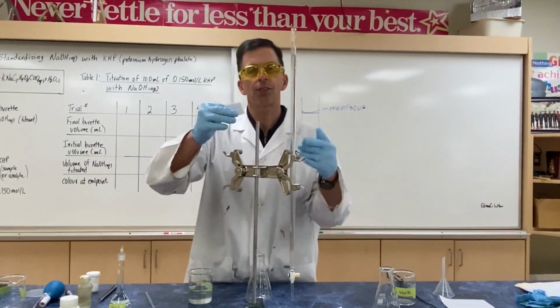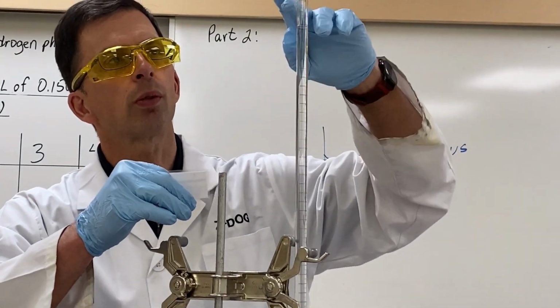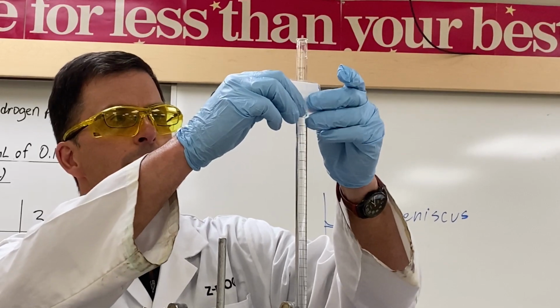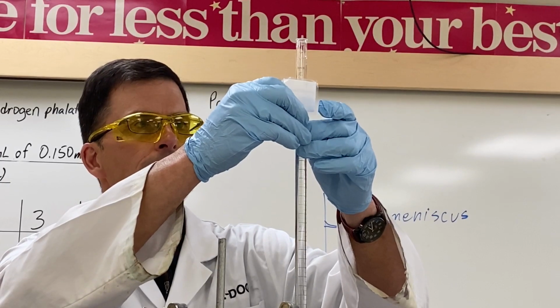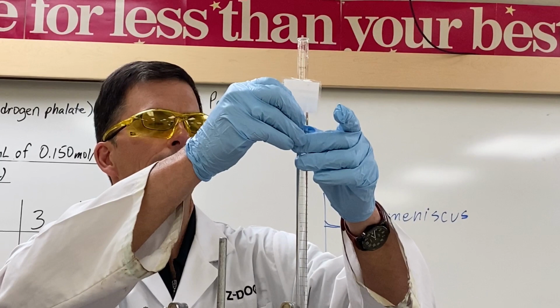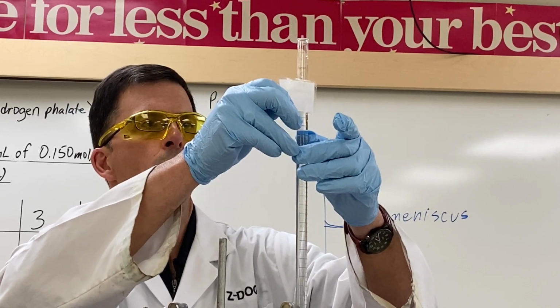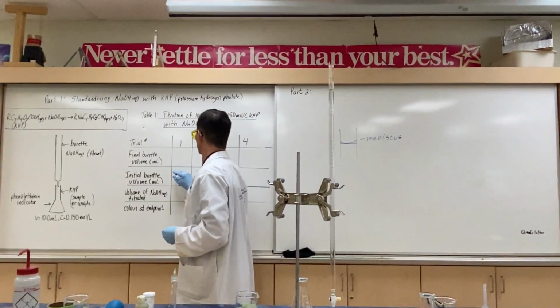A burette is set up to measure the volume of titrant delivered. So the zero is at the top, not at the bottom. It's a 50 milliliter burette, 0 milliliters at the very top, 50 milliliters at the bottom. A burette can be read to 2 decimal places. So we are estimating that second decimal place, a significant figure. 1.25 milliliters. And that is our start.